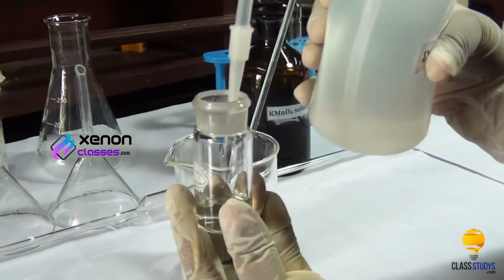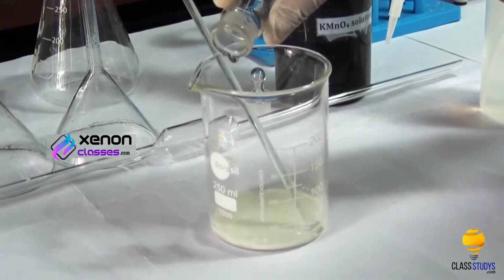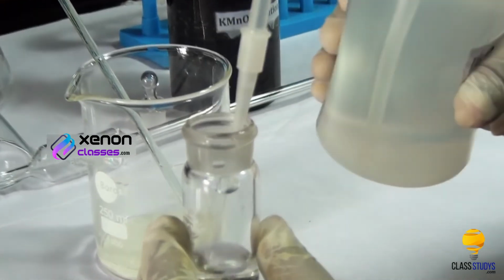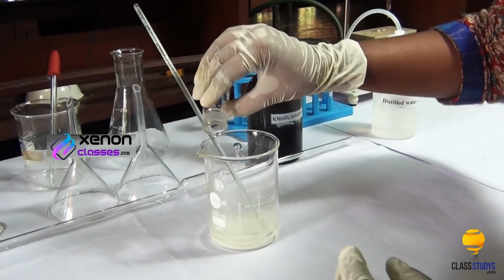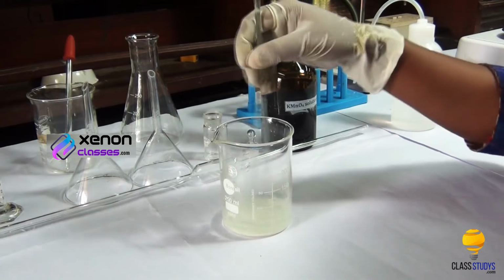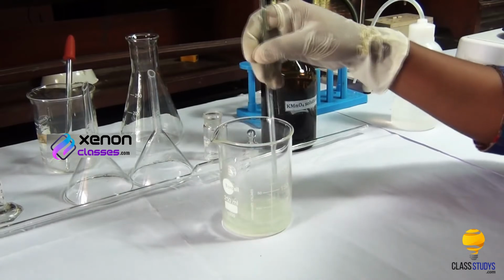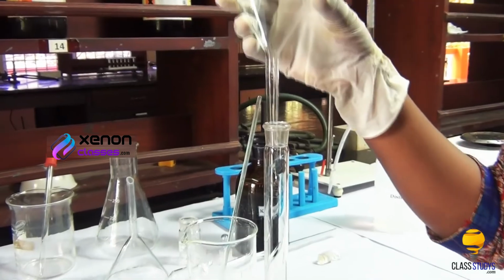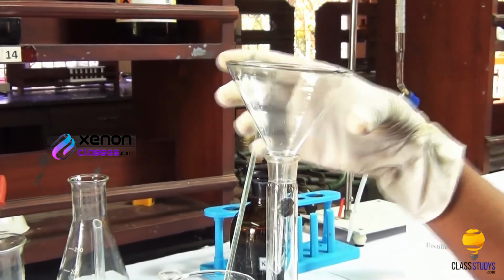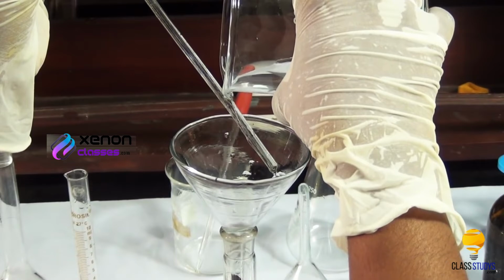Wash the weighing bottle 2 or 3 times with distilled water to transfer the particles sticking to it into the beaker. Gently stir the solution in the beaker using the glass rod to dissolve the Mohr salt crystals. Use the funnel and the glass rod to transfer the solution from the beaker into the 250 ml standard flask.